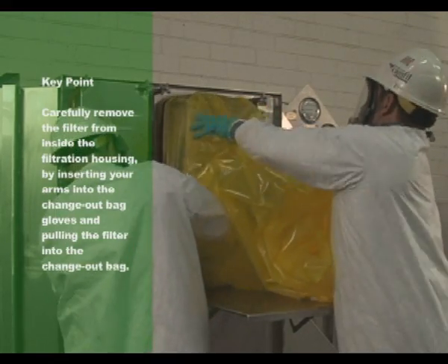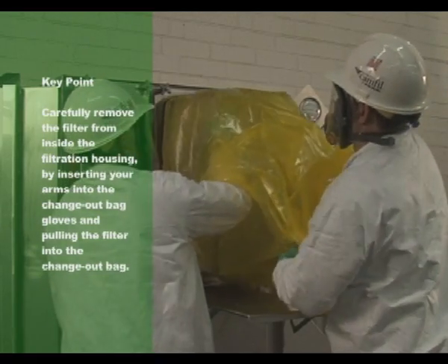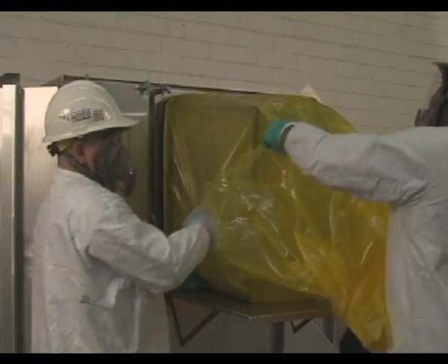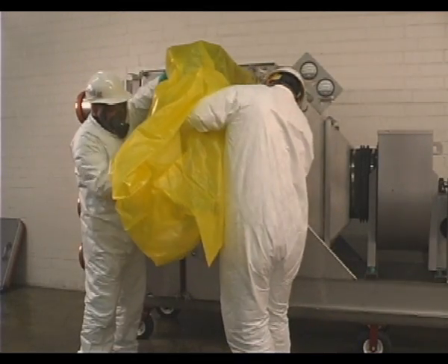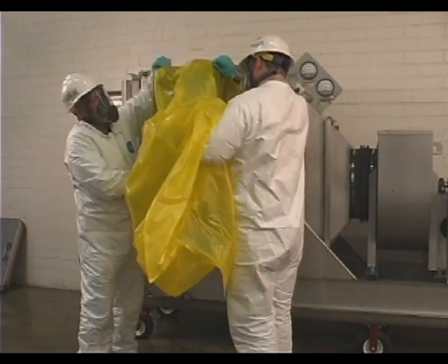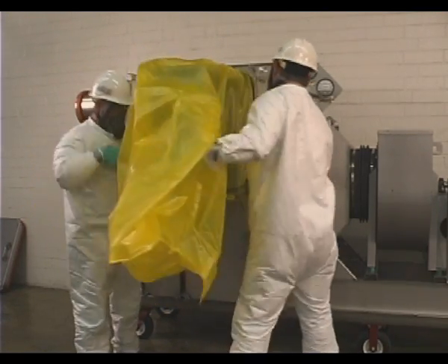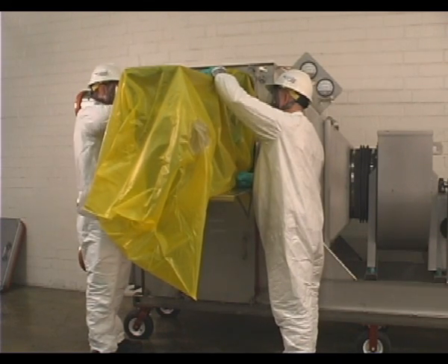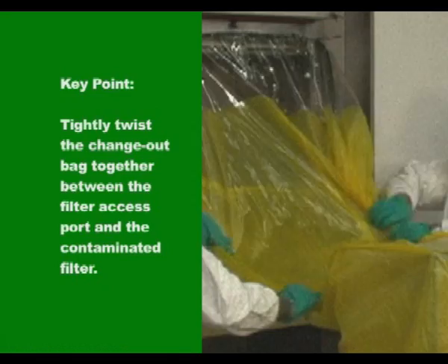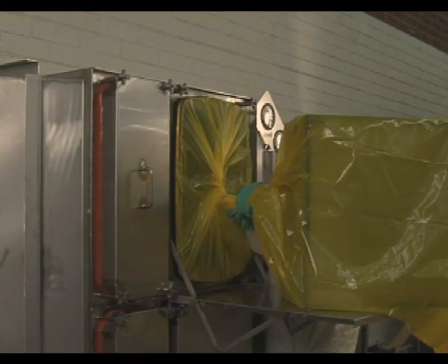Carefully remove the filter from inside the filtration housing by inserting your arms into the change out bag gloves and pulling the filter into the change out bag. Use a table or change out shelf to place the filter after removing it from the housing. Remove your arms from the change out bag gloves, leaving gloves in the bag. Once the filter is removed from the housing into the change out bag, tightly twist the change out bag together between the filter access port and the contaminated filter.